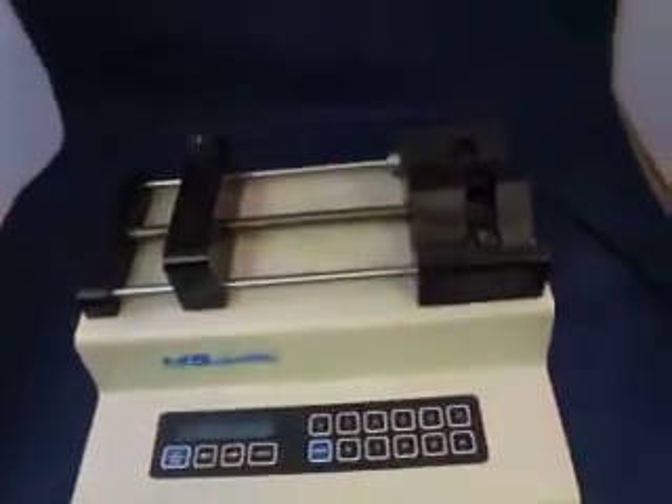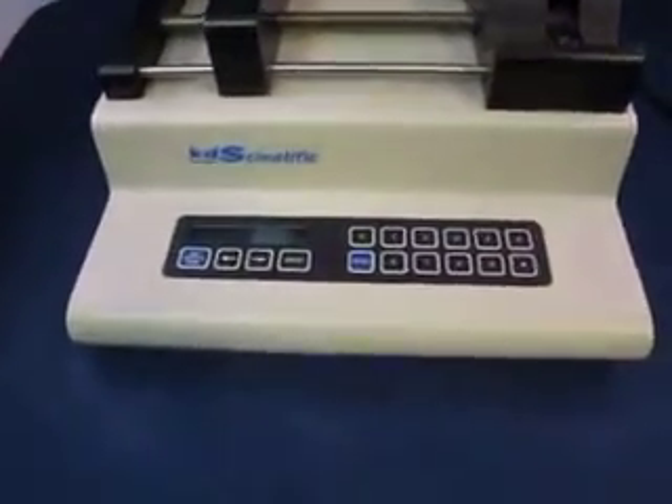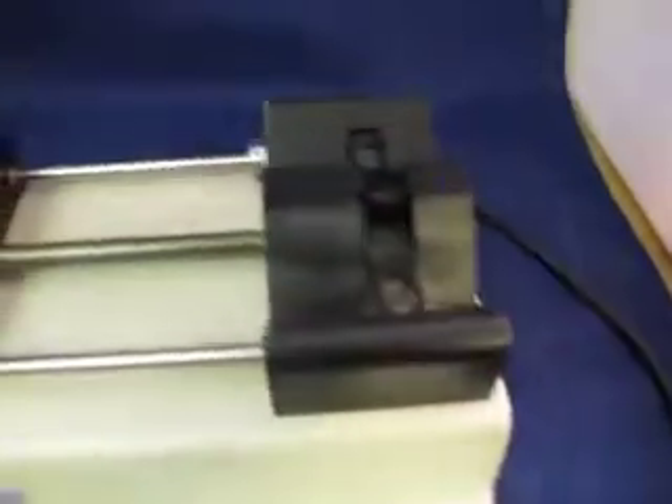You're bidding on a KDS 200. This is a dual syringe infusion pump. I don't know too much about it — this came out of a closed pharmaceutical lab.